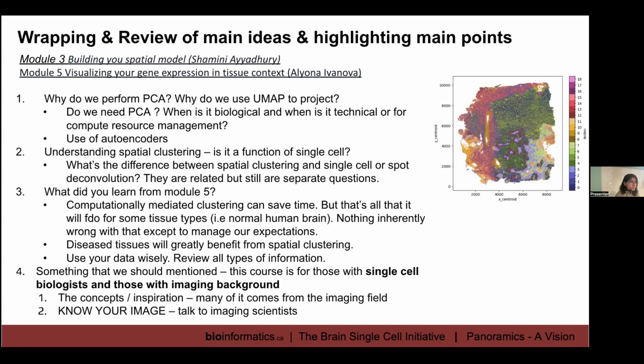Do you want to discover? Do you want to do something? Even if you want to outline all the spatial clusters which are anatomically relevant, you still have to cross-check them with your Allen mouse brain atlas. And it might just be easier for you to download the mouse brain atlas, use the annotations, and transfer them over and use that as your spatial clusters. It's all there. So it's how you derive spatial clustering, depending on what questions you want to ask.